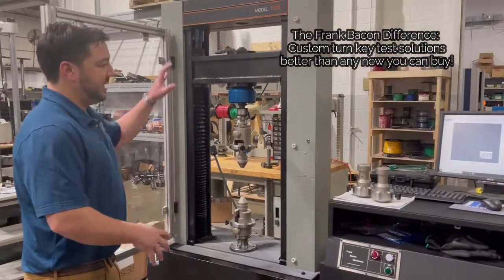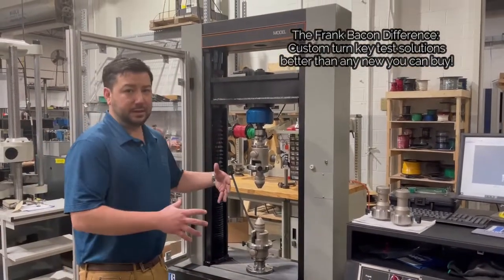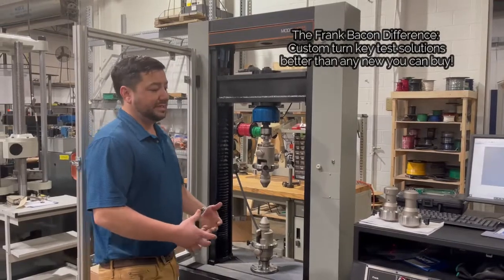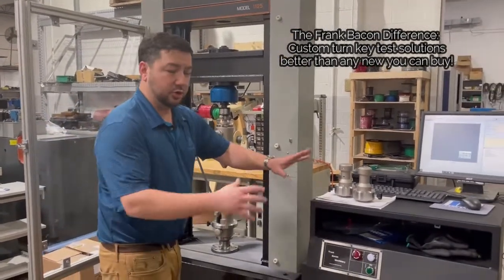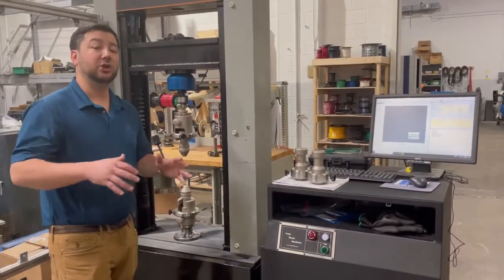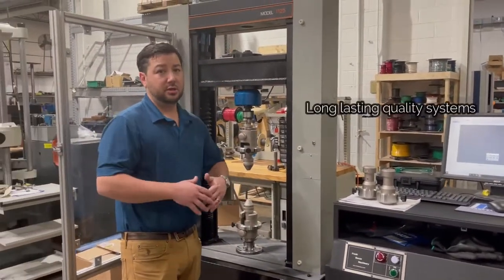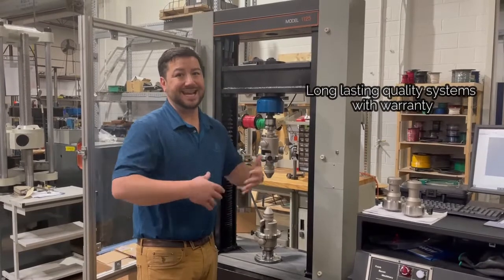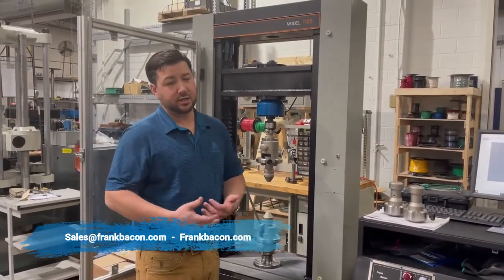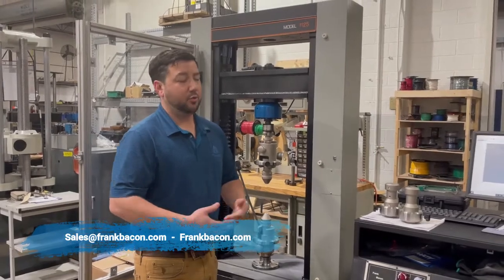So what we've done is taken an older amazing model, the 1125, and upgraded it — replaced components to give you new AC servo, new electronics, new controls, new fixturing to be a turnkey test solution that will last you for decades to come. If you'd like a similar setup to this, please contact your salesman here at Frank Bacon Machinery. We'll be glad to help you.